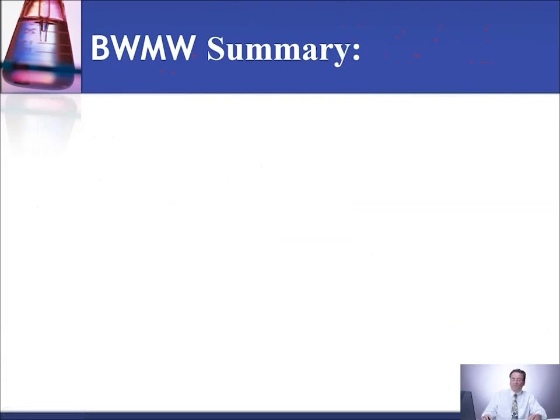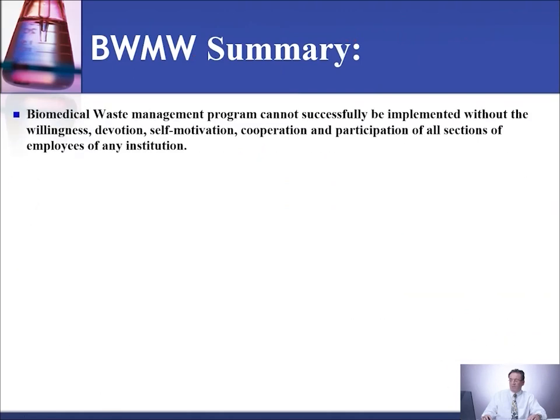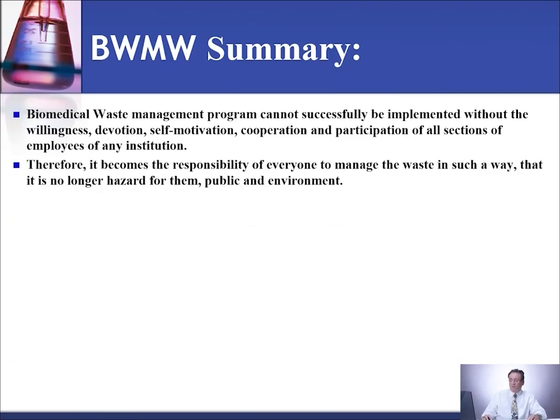Summary for biomedical waste management. A biomedical waste management program cannot be successfully implemented without the will or devotion, self-motivation, cooperation, and participation of all sections of employees of any institution. Therefore, it becomes the responsibility of everyone to manage the waste in such a way that it is no longer a hazard to them, the public, and or the environment.